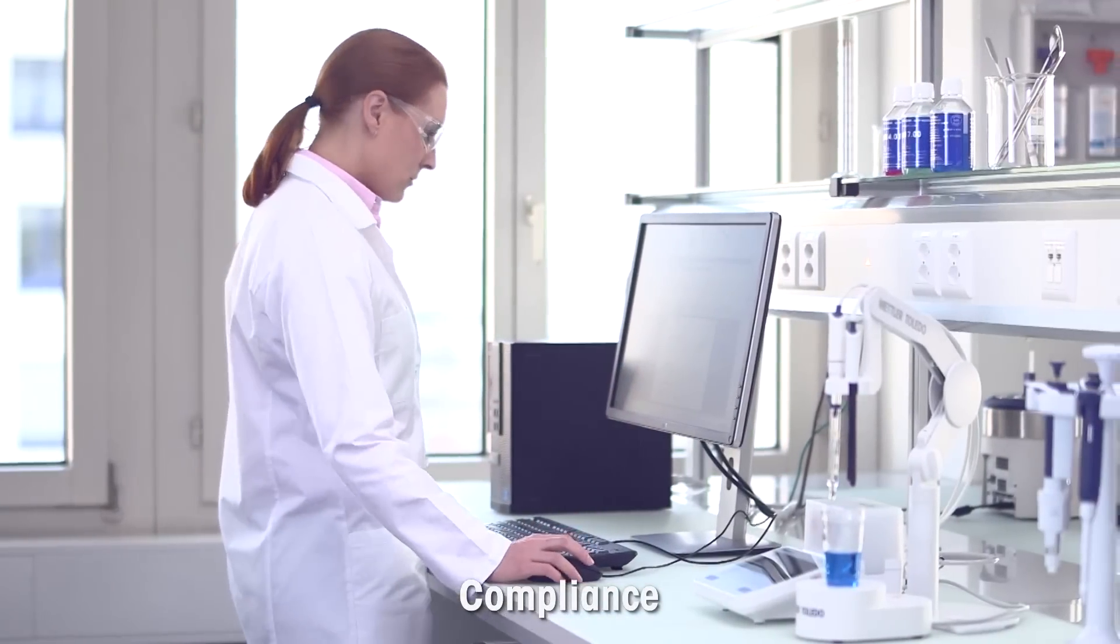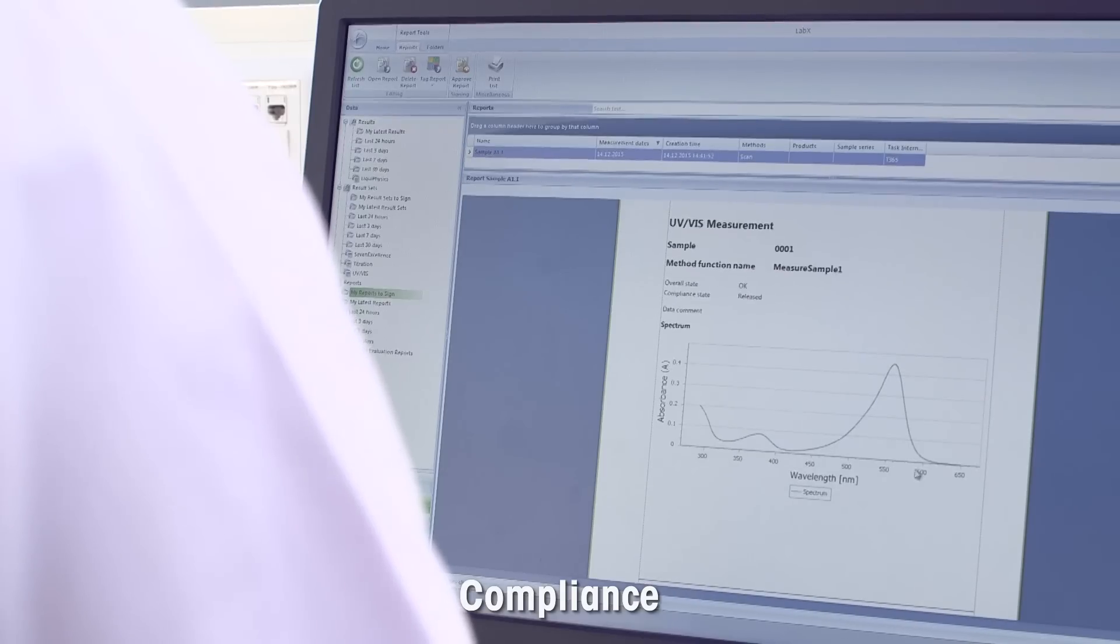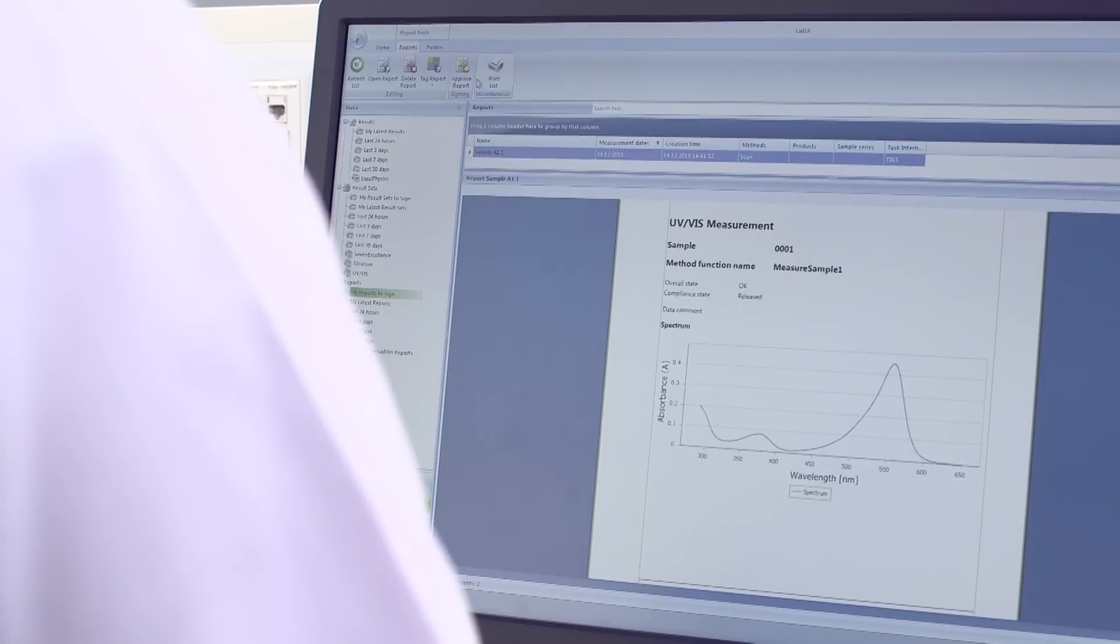Authorized users are able to define their own electronic signature and conveniently approve reports.